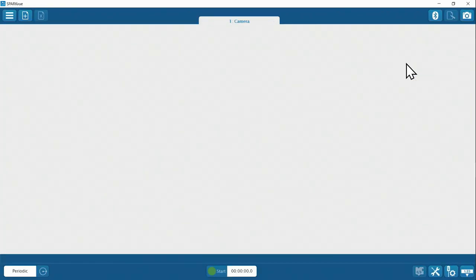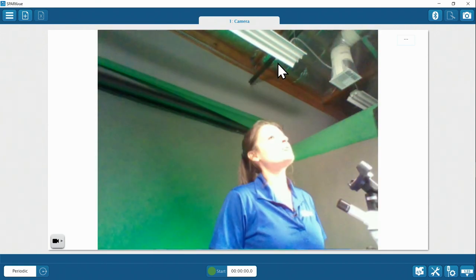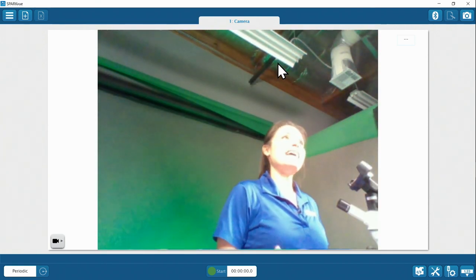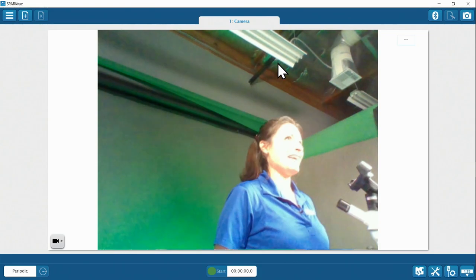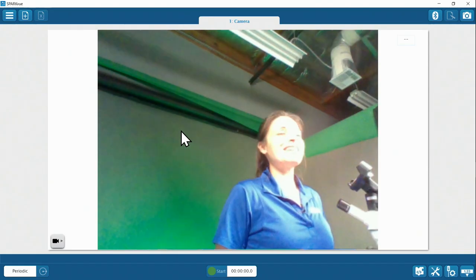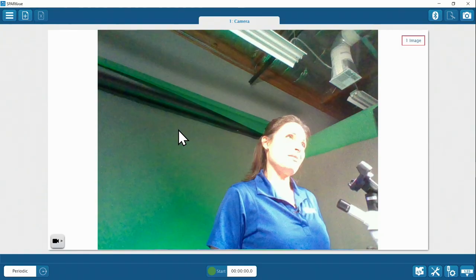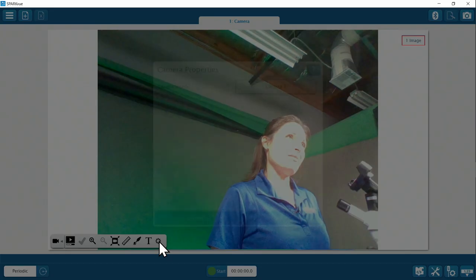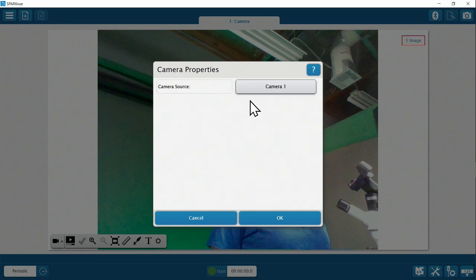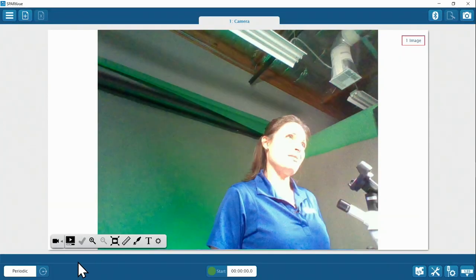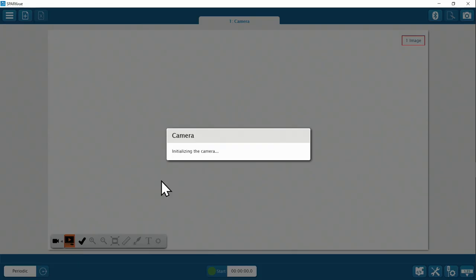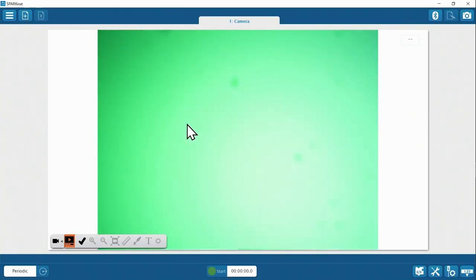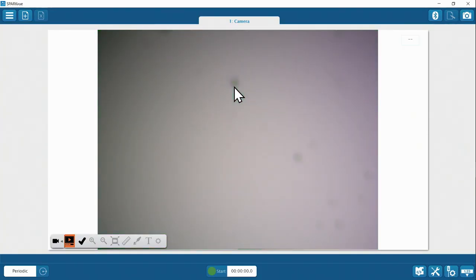Now you can click the camera icon and SparkView will bring you to a new screen. The live camera feed should be available right away. If the feed is not coming from the microscope, click inside the image to stop the live video stream, open the camera tools menu, go to settings, and try a different camera. Then select preview to go to live stream mode. That's my microscope.